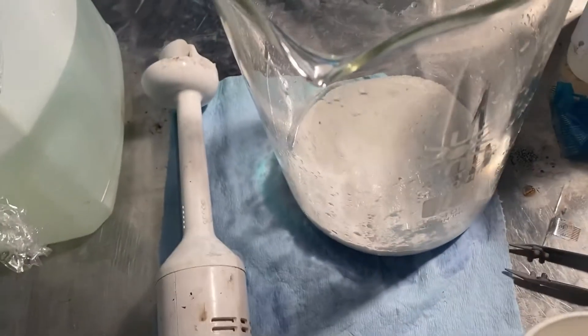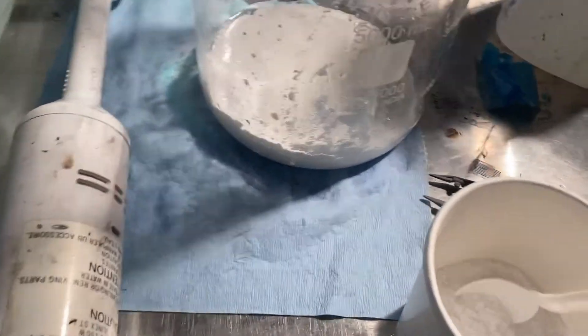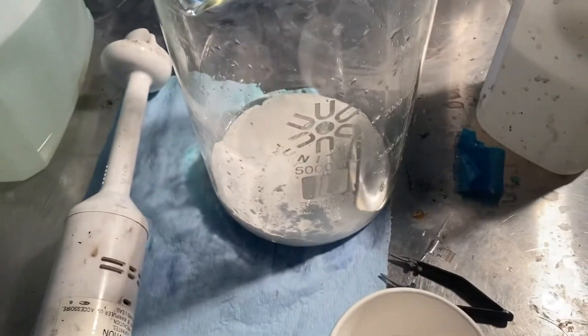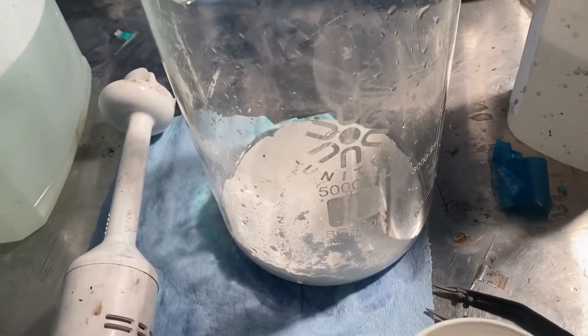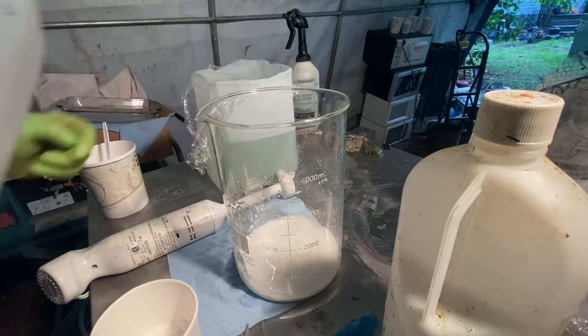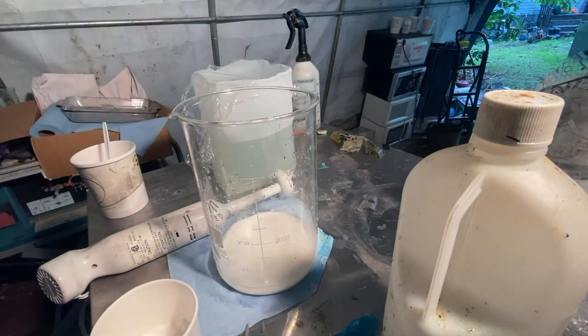Next step is we're going to take our silver chloride and turn it into silver oxide with lye. You can get that at your local hardware store. Put that in there and blend it — just a cheap blender. We'll get that step out of the way. We're going to add a little bit of distilled water to make it a little easier to blend. Be careful — don't splash — this lye will make you blind.